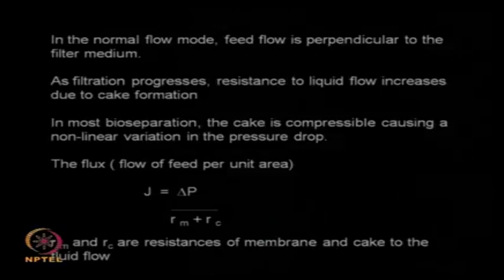And if you are using it for the separation of biomolecules or microbial cells, the cake could be compressible as well. So if the cake is compressible, there is going to be a nonlinear relationship of the flow with the pressure drop.